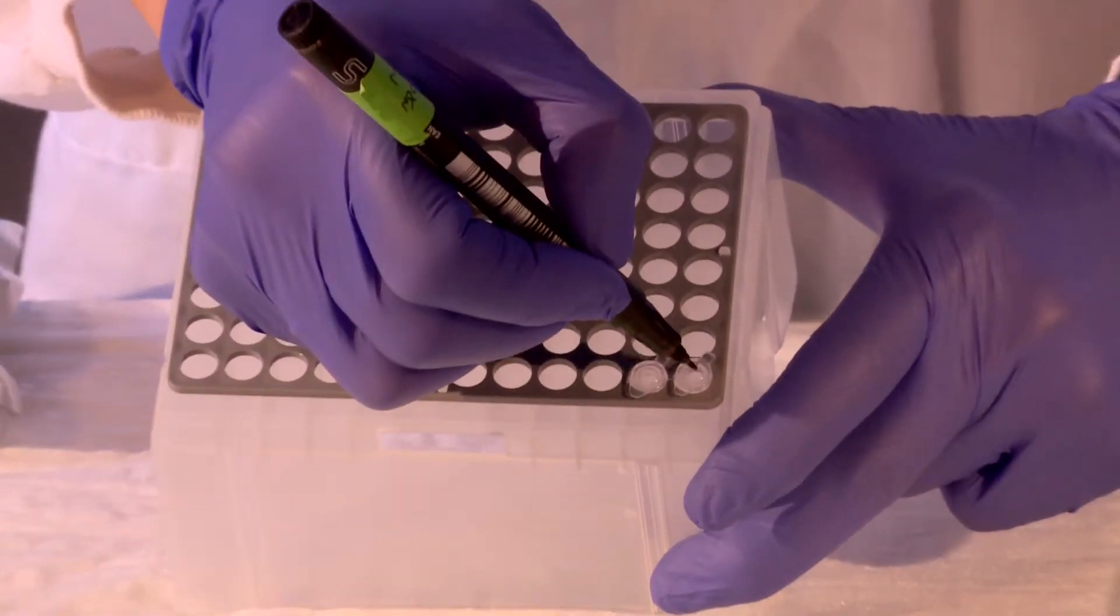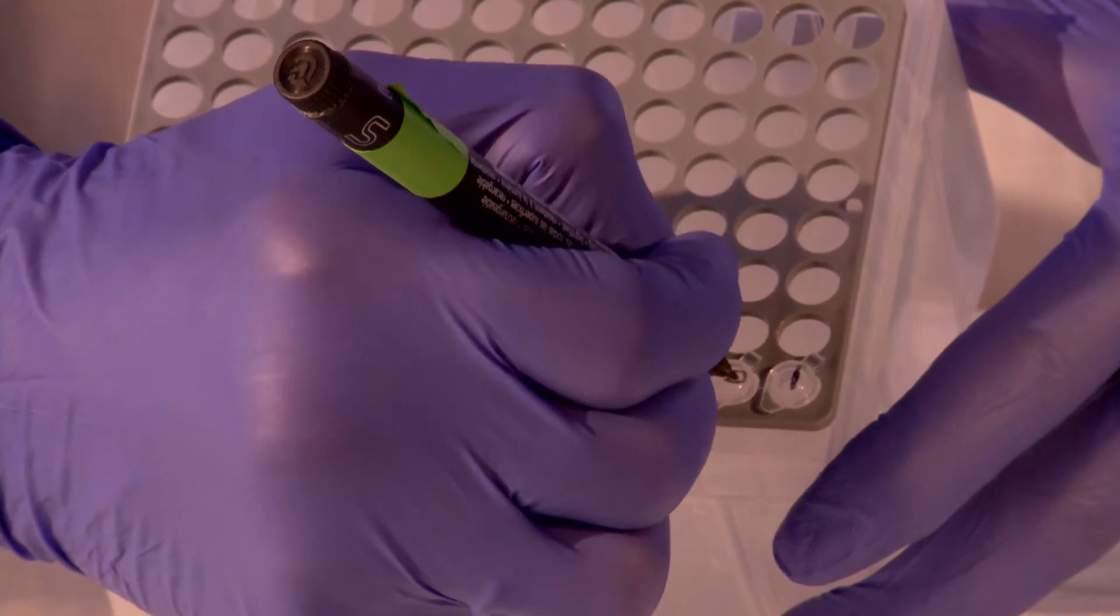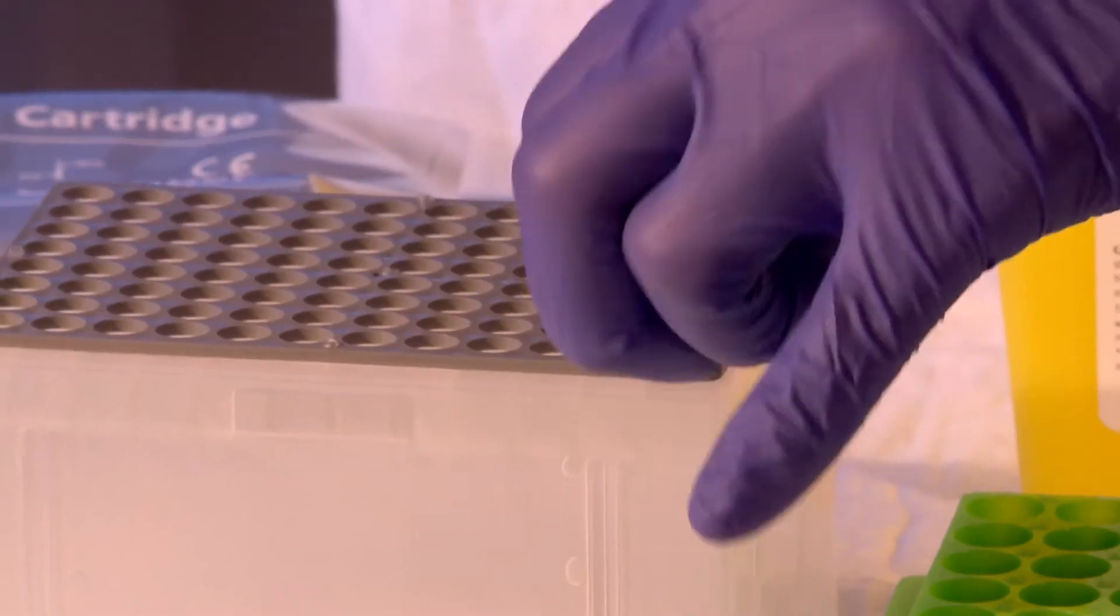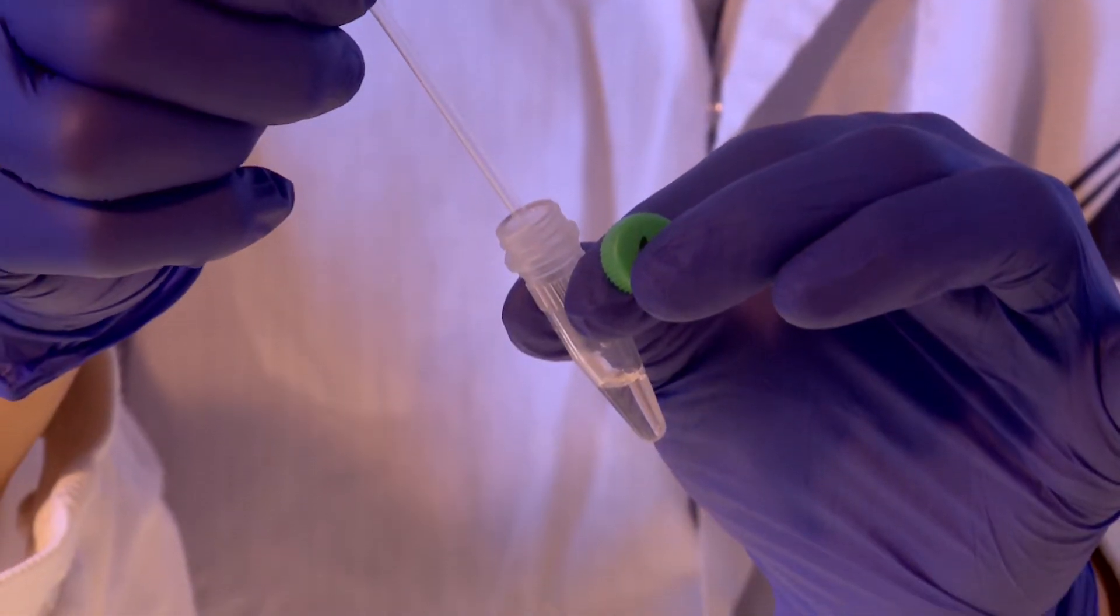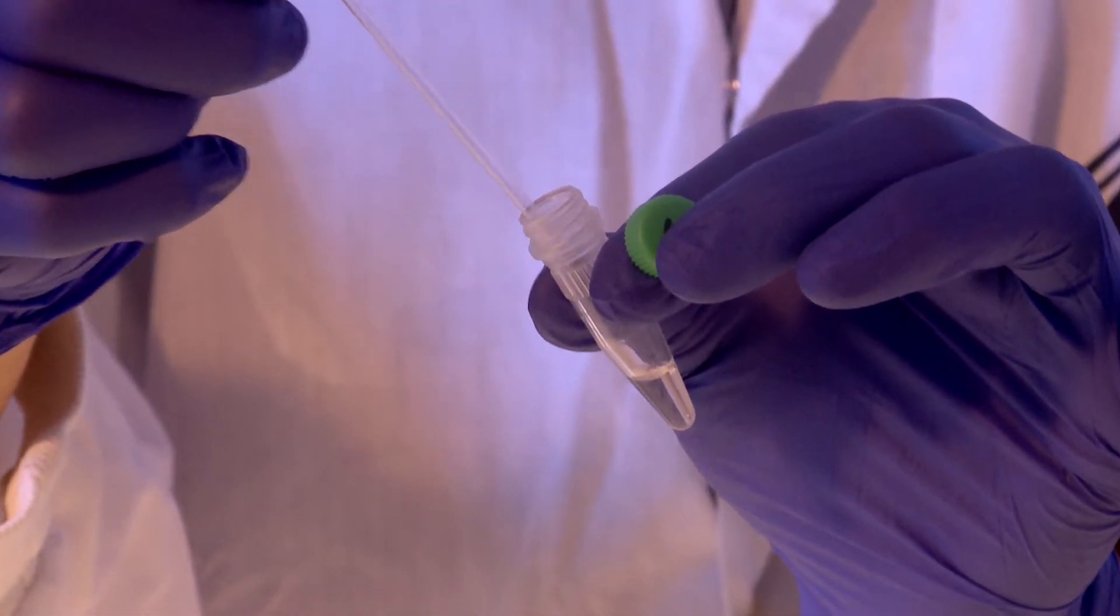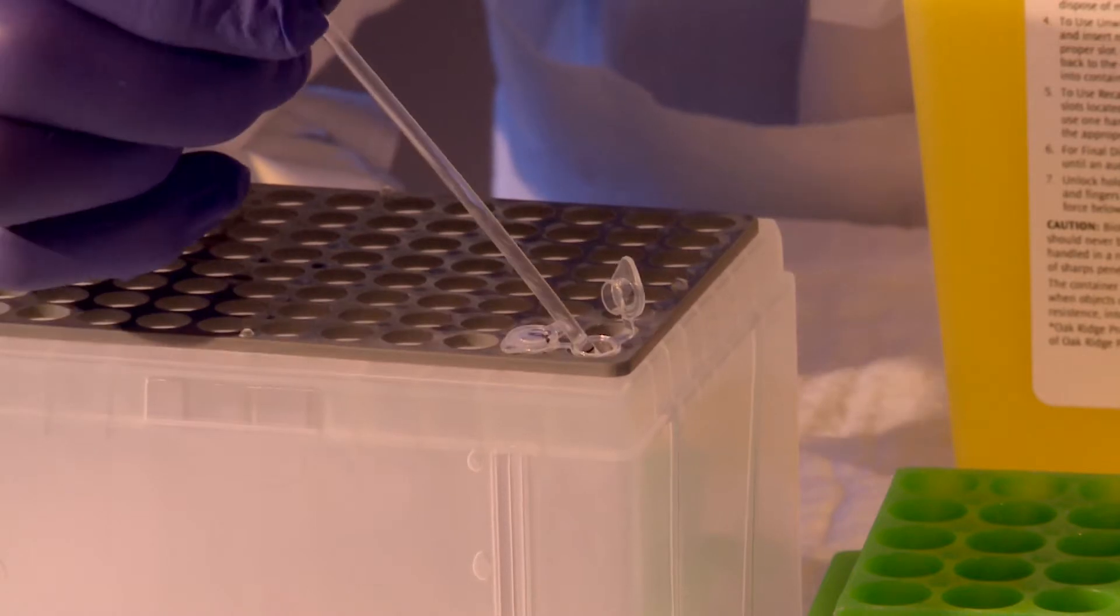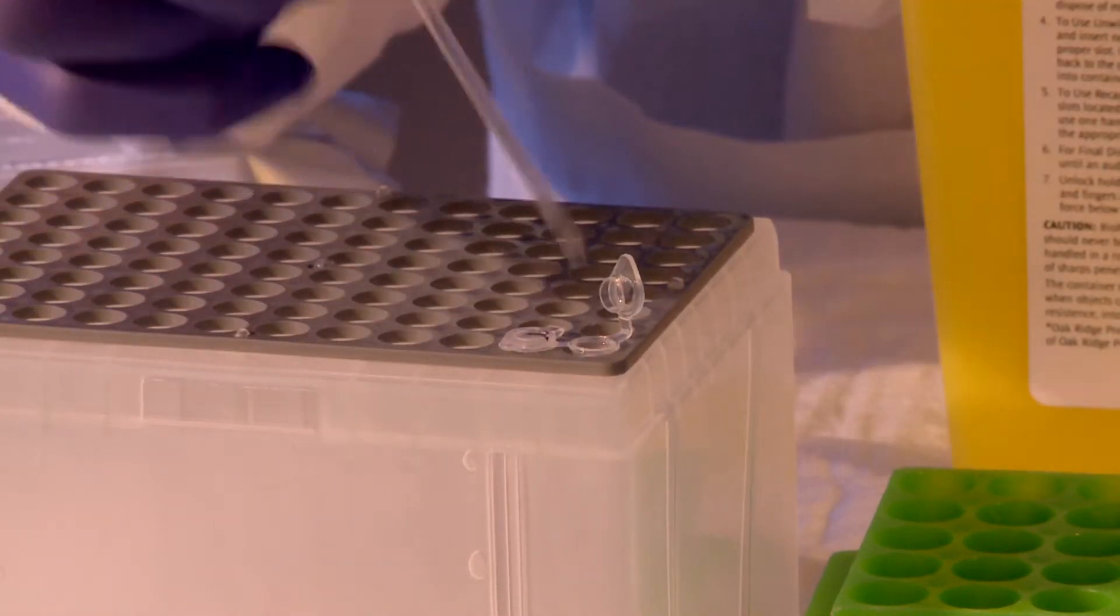Label the lid of each tube clearly for sample identification. Carefully open the lid of the reaction tubes one at a time. Using the disposable capillary tube or a micropipette, dispense 20 microliters of extracted DNA into the tube.